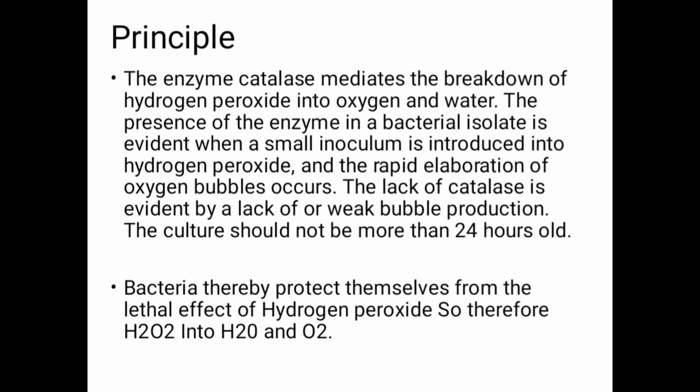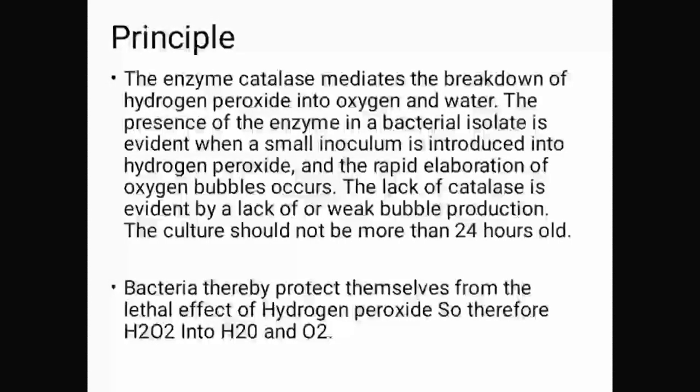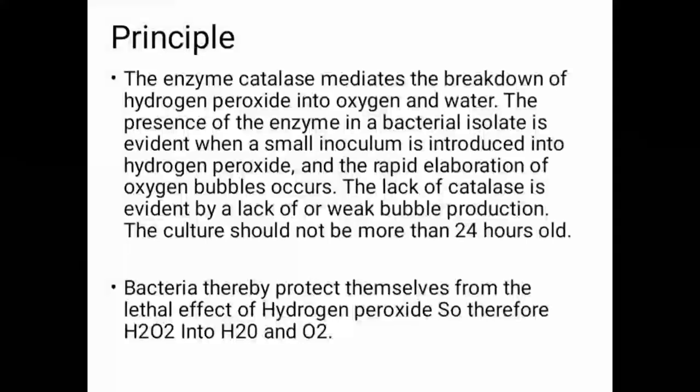Principle. The principle of the catalase test is very important. Everybody should know the basic principle of the catalase test. The enzyme catalase mediates the breakdown of hydrogen peroxide into oxygen and water. The presence of the enzyme in a bacterial isolate is evident when a small inoculum is introduced into hydrogen peroxide and rapid elaboration of oxygen bubbles occurs. The lack of catalase is evident by lack of or weak bubble production.